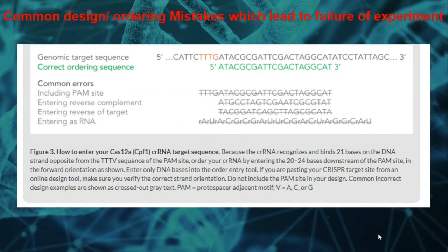So what are those mistakes? First is including the PAM site. You do not have to include the PAM site. Do not include the PAM site.